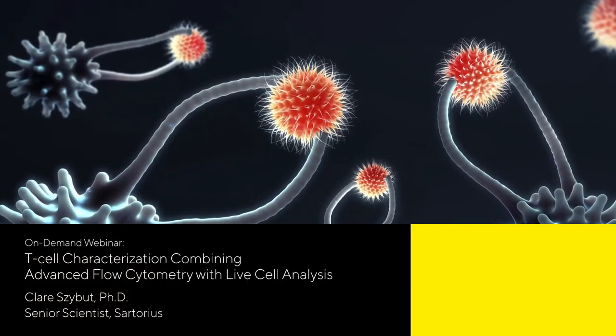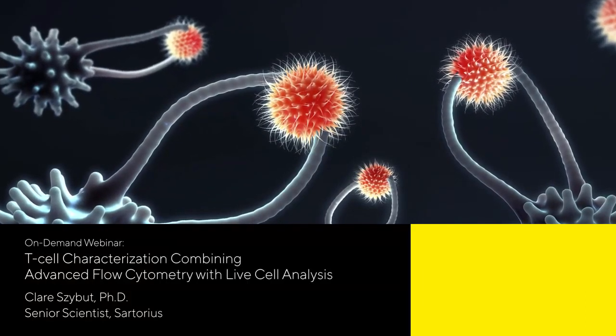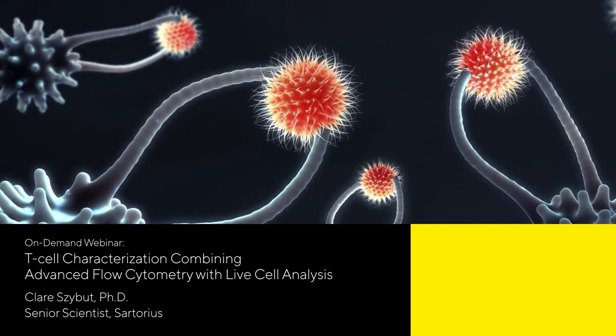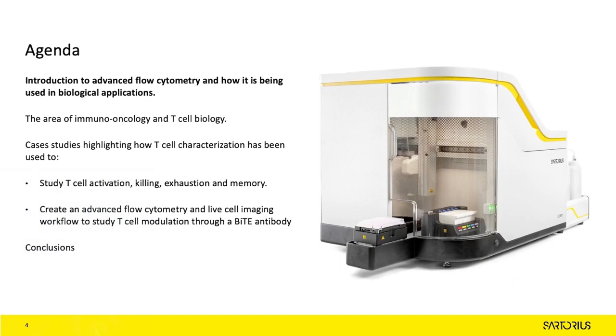I'm going to be presenting the following webinar on T-cell characterization, combining advanced flow cytometry with live cell imaging. I will start by giving an overview of advanced flow cytometry and how it is being used today in biological applications, then touch on important stages of T-cell biology and how that relates to the immuno-oncology therapeutic area, as well as how those processes could be evaluated.